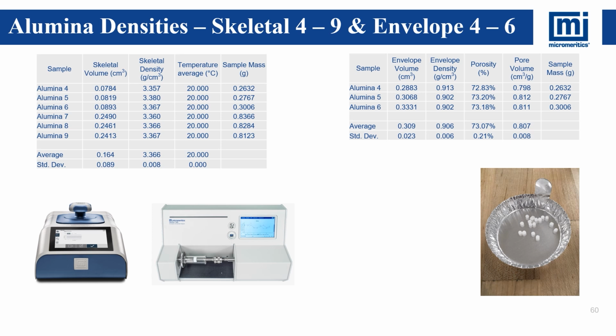We do have conversion factors for converting displacement into volume, but again, the actual value depends a little bit on how the powder packs around the sample. So if we want to improve our results, then we may want to calibrate that packing process if we can characterize materials of known volume.